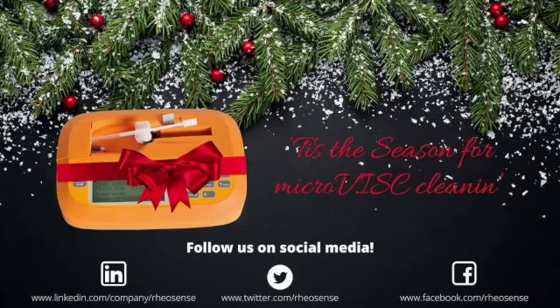The next sample we have is our, should we clean the chip or should we just? Okay.